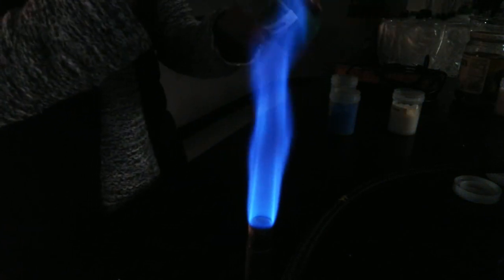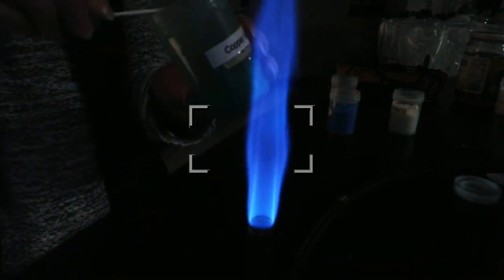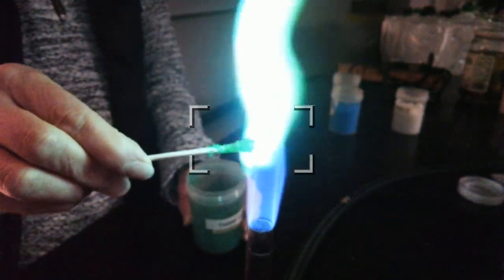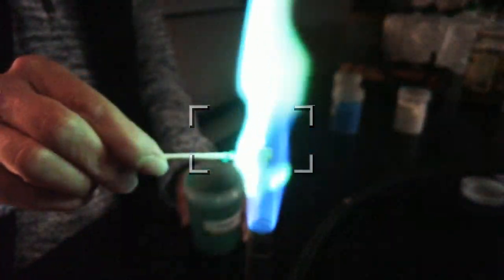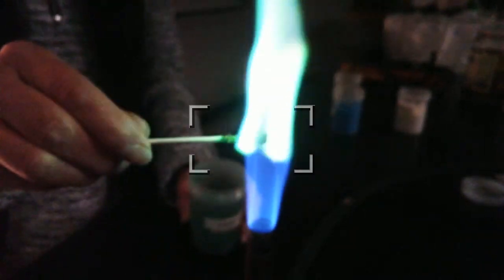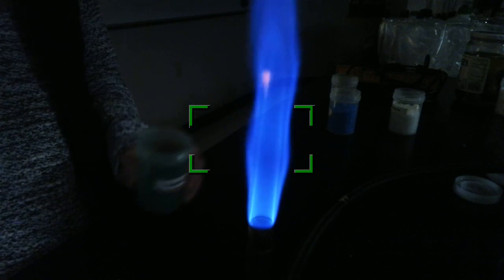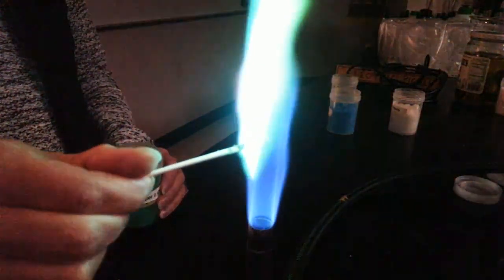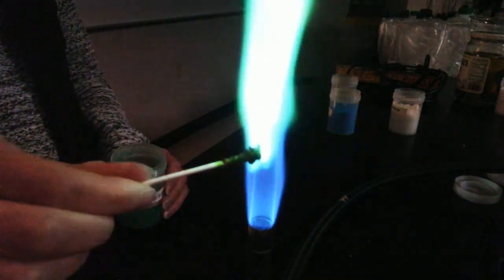I also have, this one is kind of cool. It's green. Let's see if I get in there. Can you see it? A little bit. This one is a copper chloride. It's a really pretty green color. And it burns with a bright, kind of bluish green. That one's pretty cool, which, the blue in there is definitely more of a higher energy color. So this would be another element where the electrons are gaining higher amounts of energy and then they're releasing higher amounts of energy as they fall back down to their ground state.